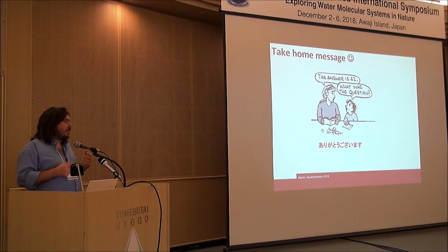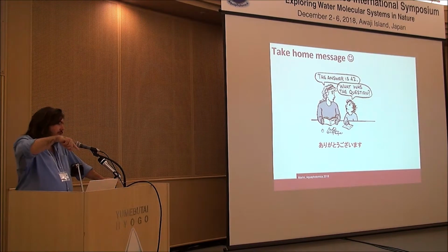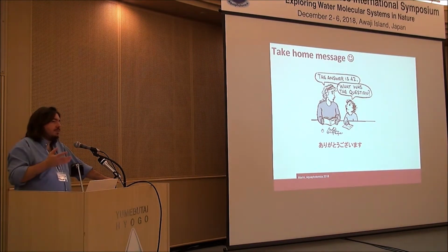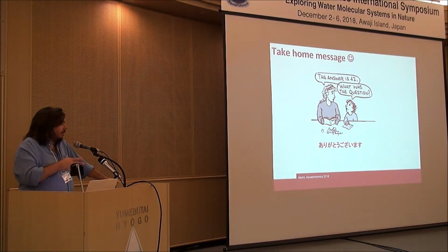But in some cases, we know that scree plots of the PCA, cross-validation and whatever may not give a proper estimate of the true number of components in the data set.